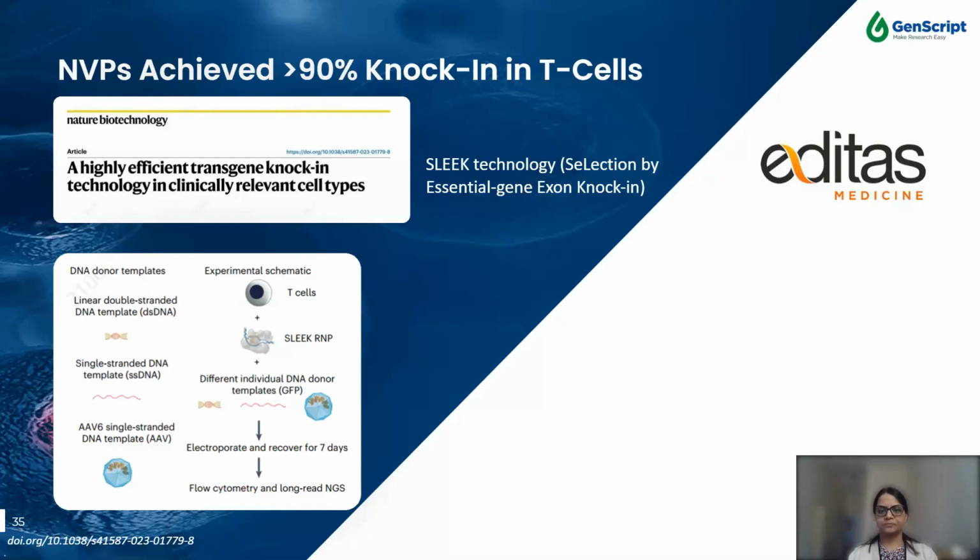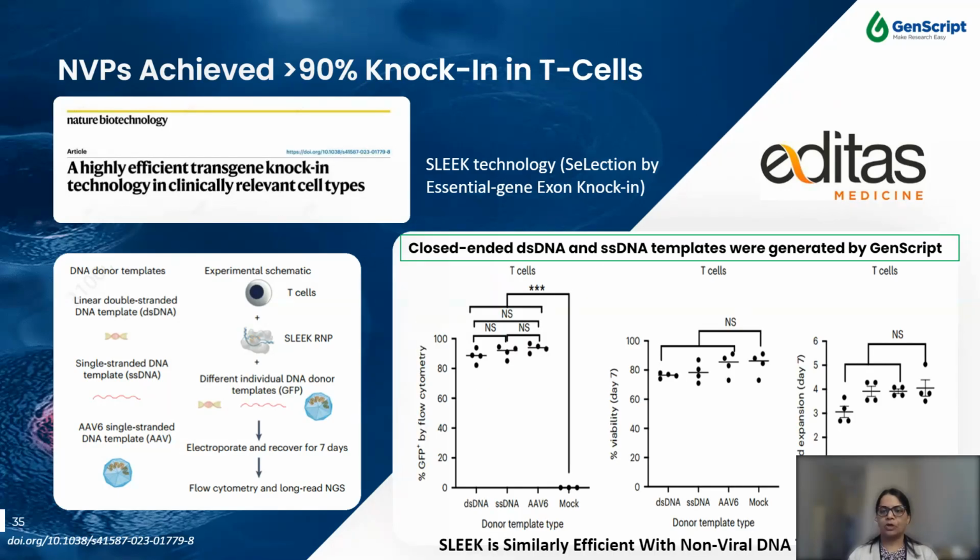Upon comparing the SLEEK knock-in efficiency, day 7 viability, and fold expansion among these three various DNA templates, they observed minimal difference between the ssDNA template and AAV6.